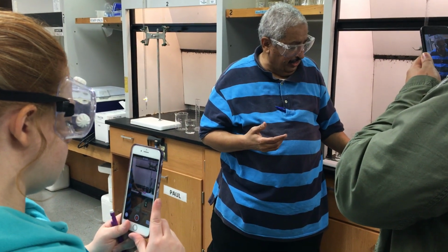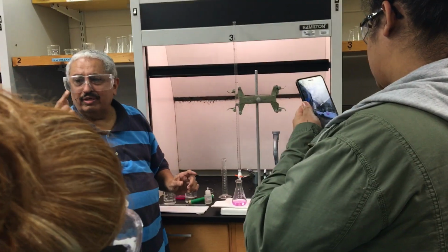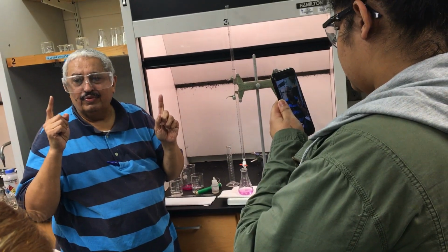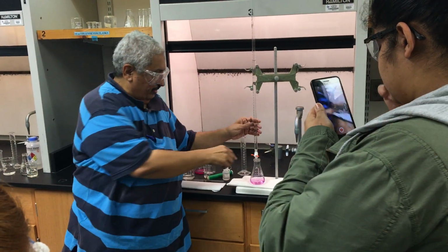If I keep this color here, this color will disappear. What happened? This color tells me one drop of sodium hydroxide turned the acetic acid with the phenolphthalein from colorless to pink. One drop of sodium hydroxide turned it pink, which is here, correct? See how nice the color is?